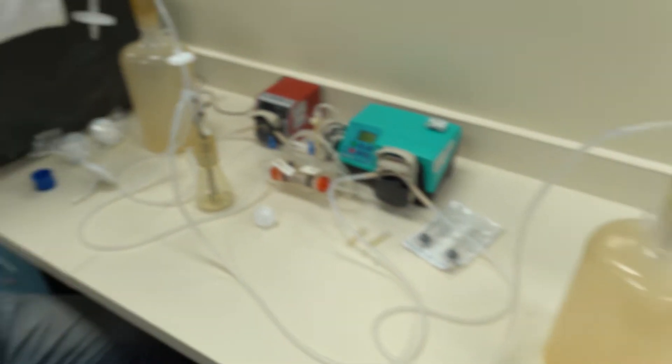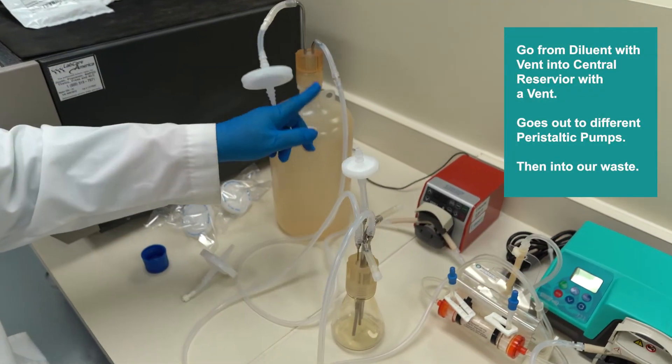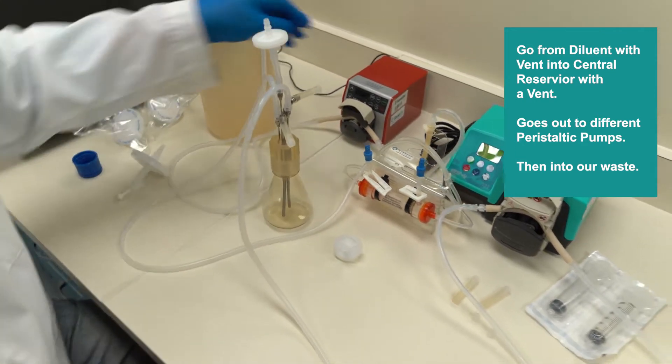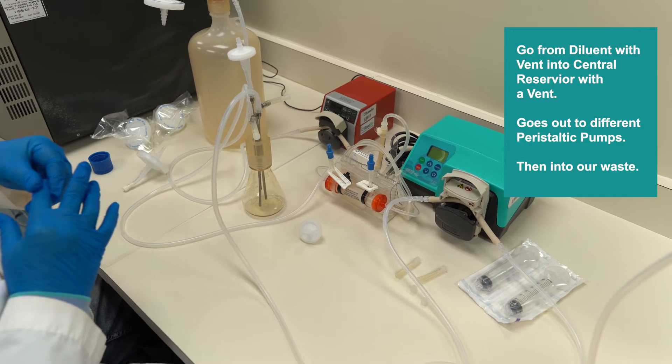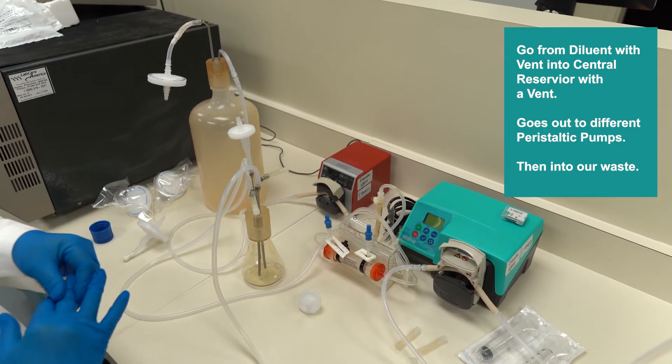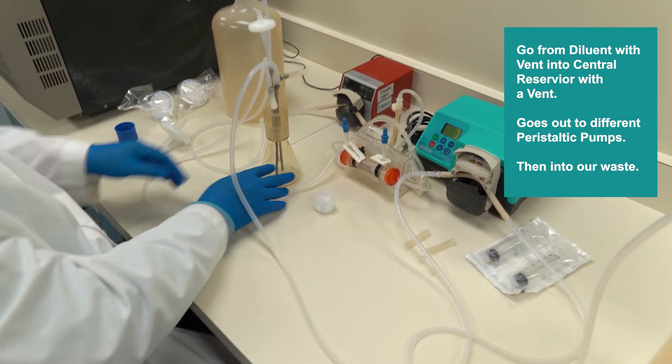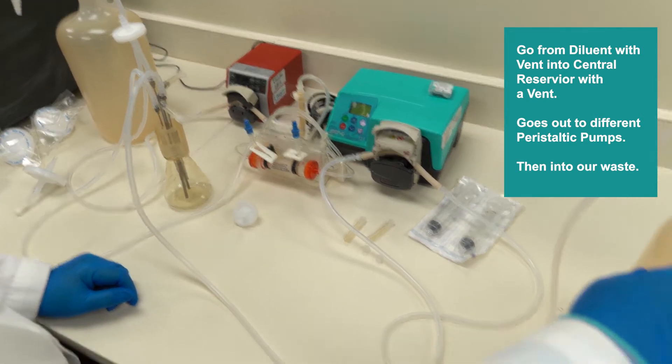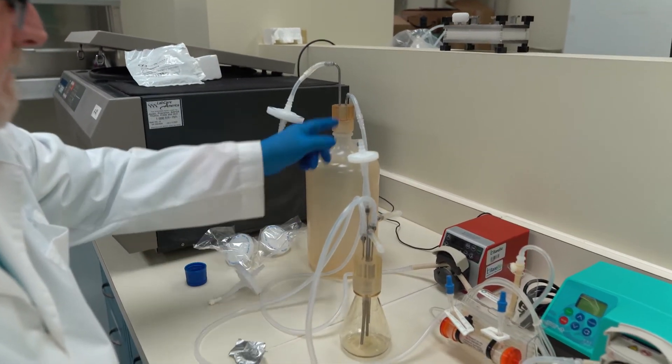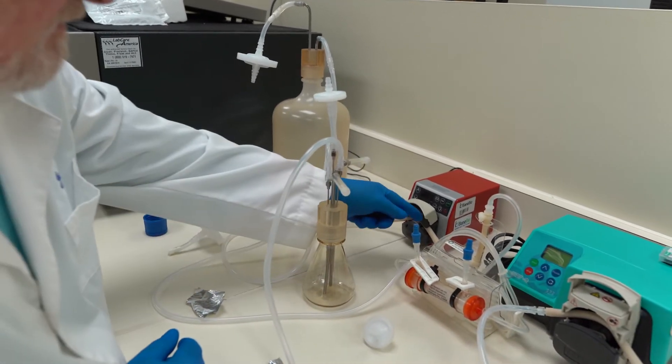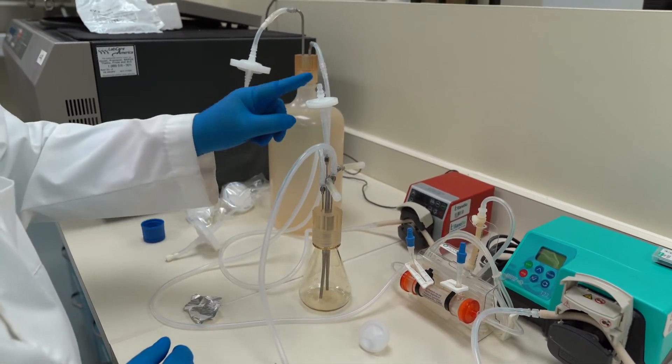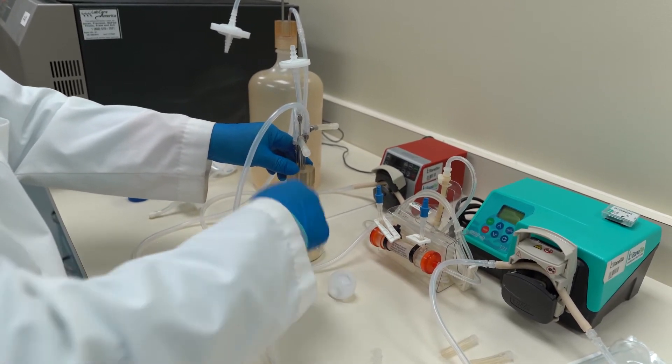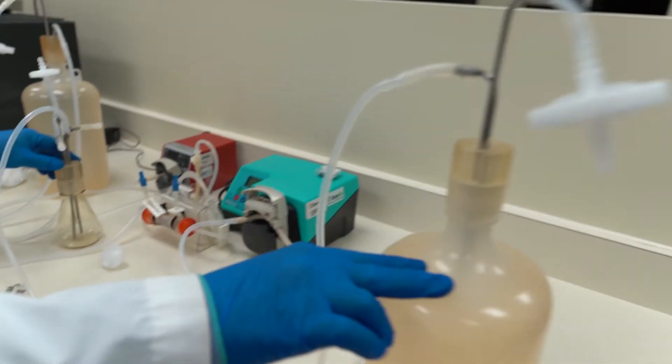So we go from our diluent. A vent out of the bottom of the bottle into the central reservoir with a vent. Diluent out. And they each have their own separate peristaltic pumps. There are different ways that we can set that up but it's easiest now with little digital peristaltic pumps to set the flow rates where we want them to be to maintain the central reservoir at a constant level. And then into our waste. Here we have our vent. Tubing down at the bottom. Diluent through the pump. Central reservoir. We have our vent. The level of the central reservoir remains constant here. Down in the peristaltic pump. Back to our waste.